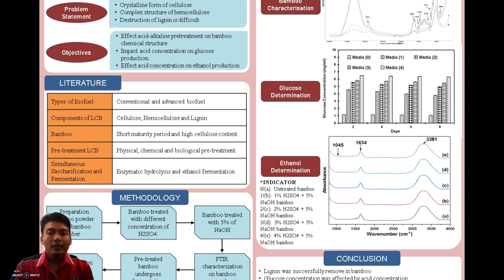From this study, the concentration of glucose is not the reason for the failure of bioethanol production in this experiment. Next, the condition of the dry yeast before the experiment was suspected to be a factor. Since the dry yeast was not checked before the experiment, a small experiment was conducted to check its condition. A 5% glucose solution was prepared and heated to 37 Celsius. The yeast was then put in the warm solution for 15 minutes. If a bubble formed in the solution, it indicates the yeast was alive. From this experiment, it was observed that no bubble formed after 15 minutes. Thus, it is assumed that the yeast died before the experiment started.